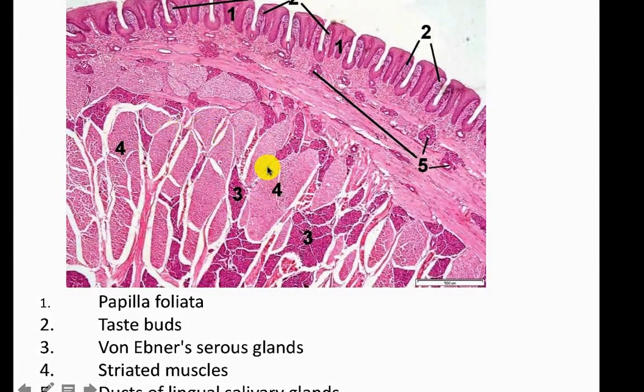Here we have the picture of the tongue of the rabbit, and on its dorsum we have these rectangular papillae with the famous two ridges like the letter 11 of epithelium alternating with furrows of connective tissue or lamina propria, and they have a lot of taste buds at the side walls. Here we have a duct opening in the groove in between the papillae. It is a duct of glands. The glands here are serous glands like those of von Ebner present in relation to the circumvallate papilla.